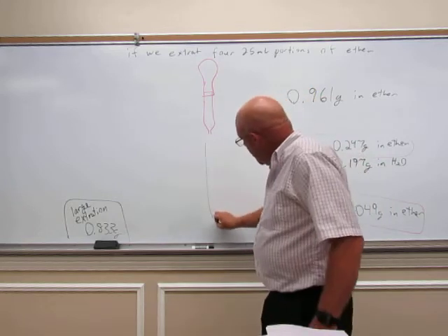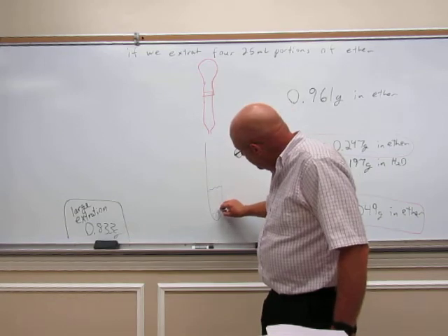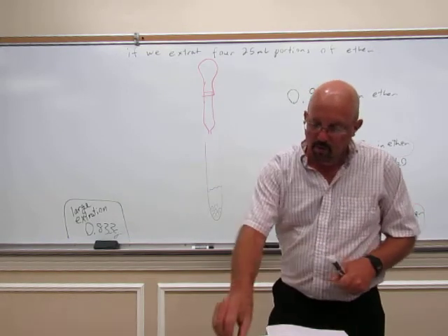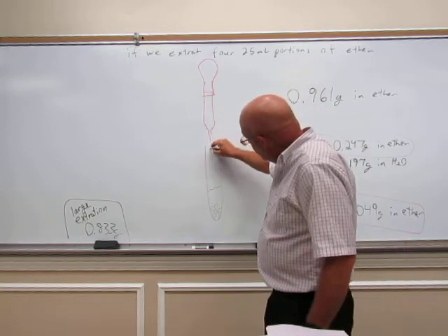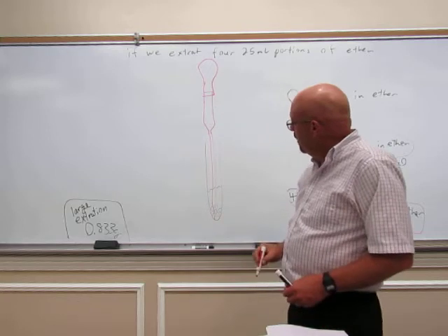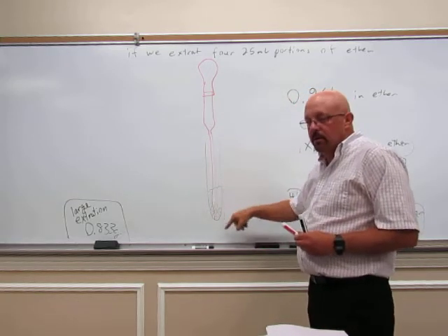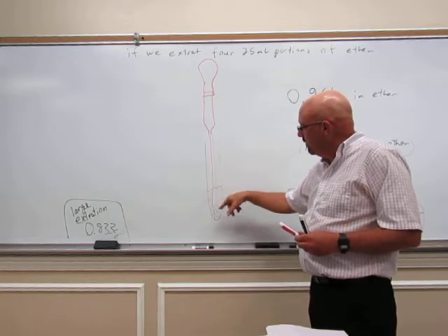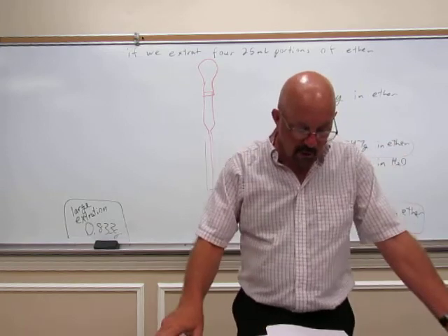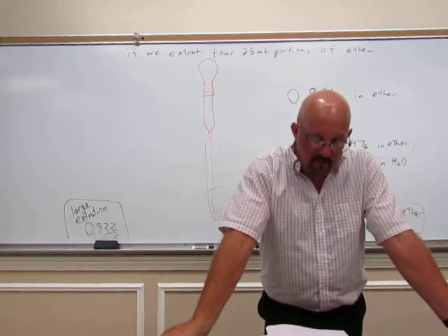So you can use a pasteur pipette. You've got your reaction tube, we have the dichloromethane, you have the little calcium chloride pellets there in the bottom. Again, we're going to use a pasteur pipette. Those pellets are big enough, they're not going to get sucked up. You don't have to worry about it. So take your pipette all the way to the bottom and suck up the dichloromethane liquid along with the benzoic acid. It's dissolved in it, and leave the pellets behind. So you'll transfer that over into your pre-weighed Erlenmeyer flask.